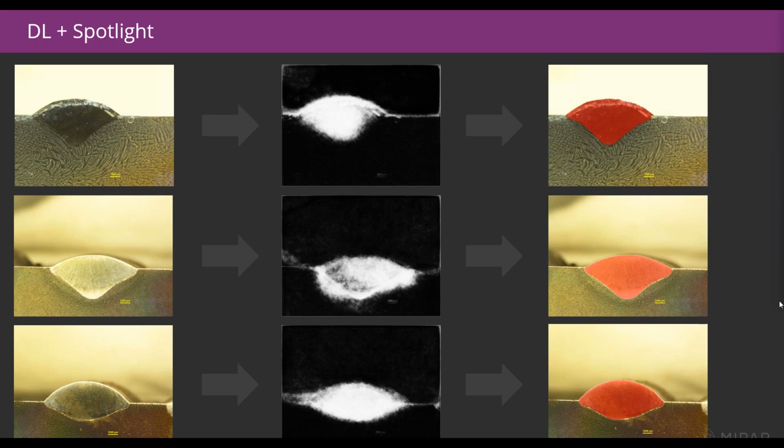Our next question is, we often have images that are not as good quality as your examples. How does your software handle imperfections like metallographic scratches or etching variations? Sure, really good question. So, I did try to find images that weren't always the best of cases. We typically deal with the hardest problems, I'll just say, to be upfront. We're 7 years out now as a company, so there've been plenty of other tools that have been around for longer, and many of them open source.